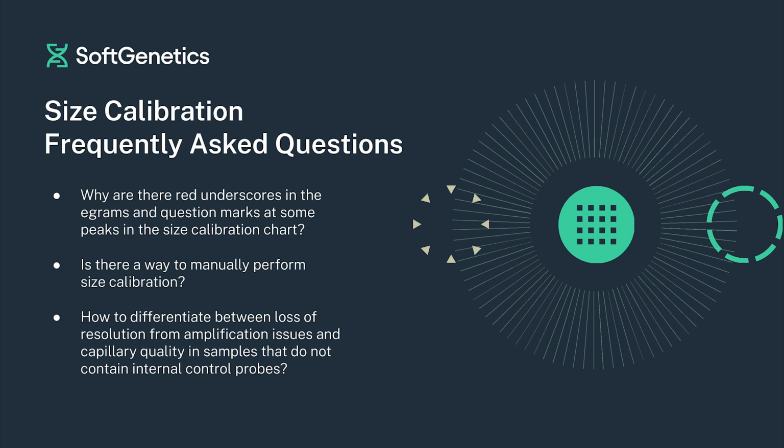We'd like to take a look today at size calibration frequently asked questions. These are questions that apply to any of the fragment analysis software, GeneMarker HID, and ChimerMarker. We're going to look at three examples, and we'll do this in slides and then open the software to have it so you can visualize the situation, and hopefully this is helpful.